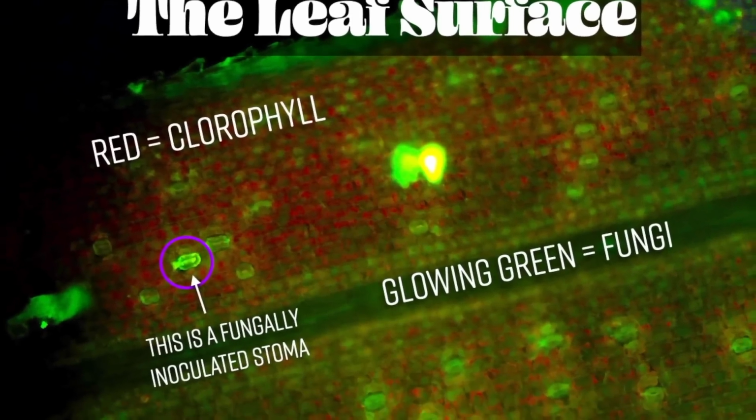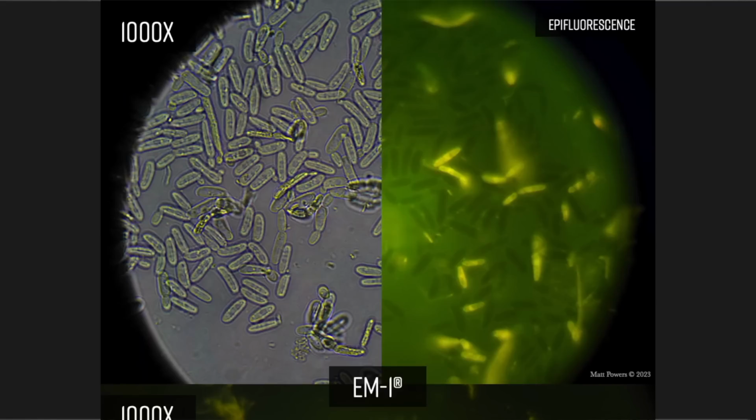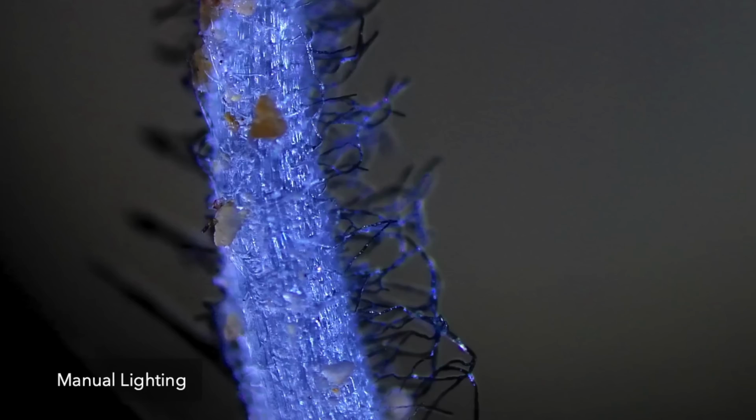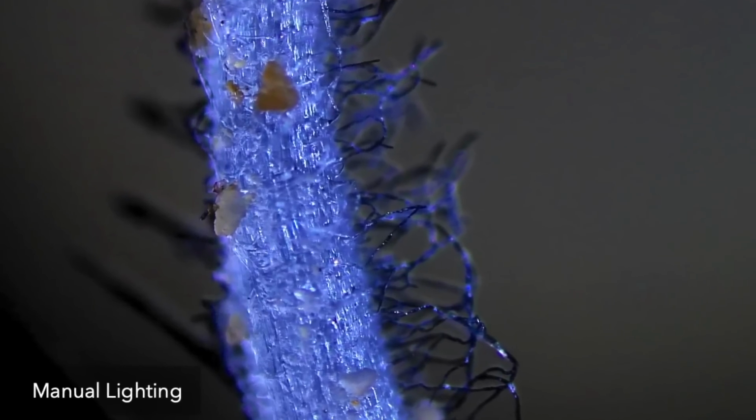We cover it all. And it goes beyond bright field. So it's dark field, it's epifluorescence lighting so you can see the invisible fungi, you can see the phosphorus where it goes and where it glows. And also manual lighting, which is a new creation that allows us to visualize roots and plant surfaces at a completely new level and allows us to see them in a much more natural and understandable light.